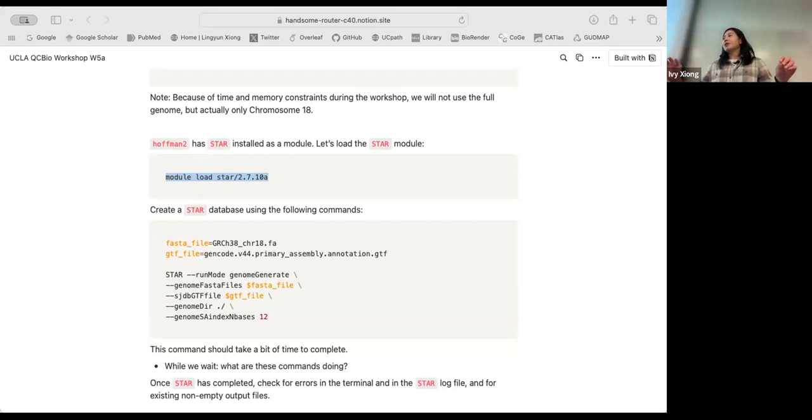Instead of doing it in a linear fashion, you can index different regions. When sequence is coming in, you can go through each region simultaneously, because when we are doing alignment, we're going to be using a lot of parallel computing.